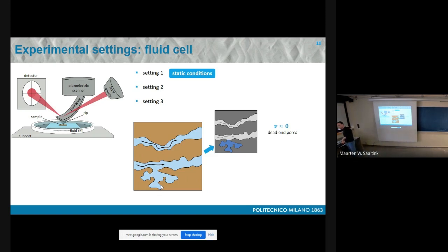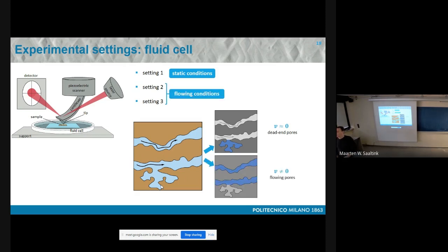Then, how thick is the layer? Sorry? You have one layer which is about less than a millimeter. Then it will saturate if it is static? Yes, of course. It saturates very fast.